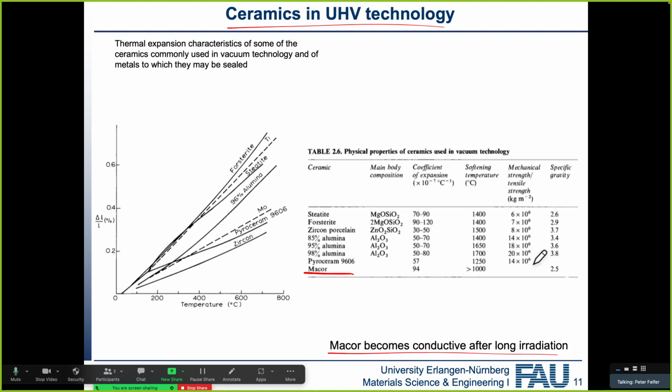So the thing about ceramics, though, is almost all of them are pretty okay to use, but usually we use the ones that we can match in thermal expansion coefficient to the metals that we use. Because while you bake, your system obviously gets warm and cold and expands and contracts. So you need to have things that are thermally compatible with each other.